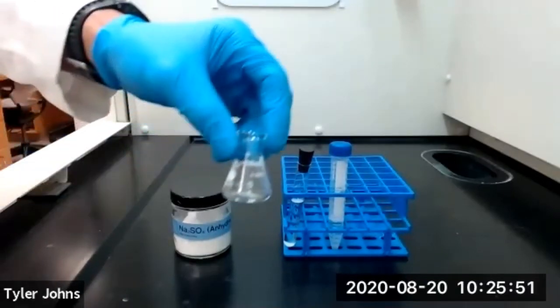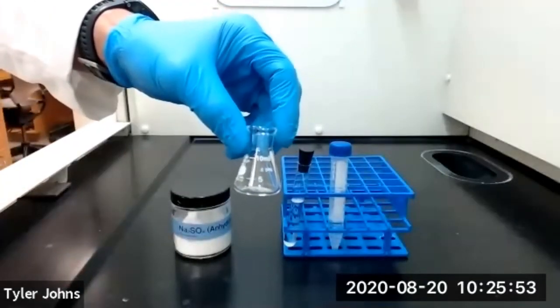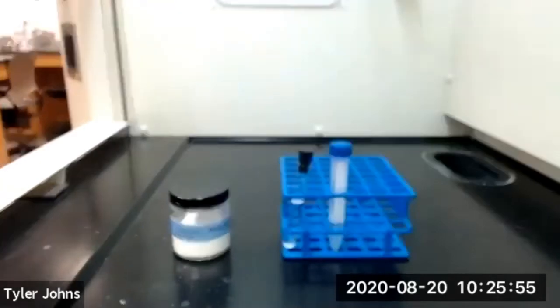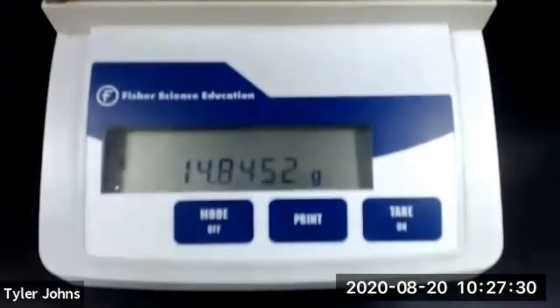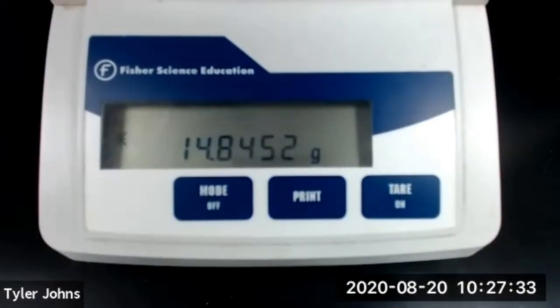The mass of our 10 milliliter Erlenmeyer flask is 14.8452 grams.